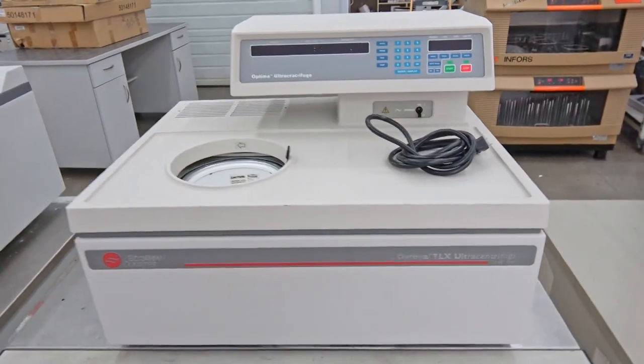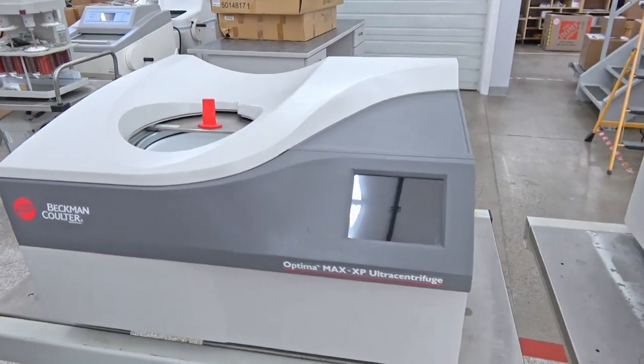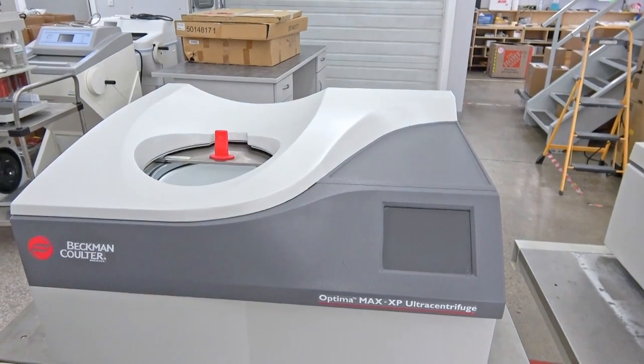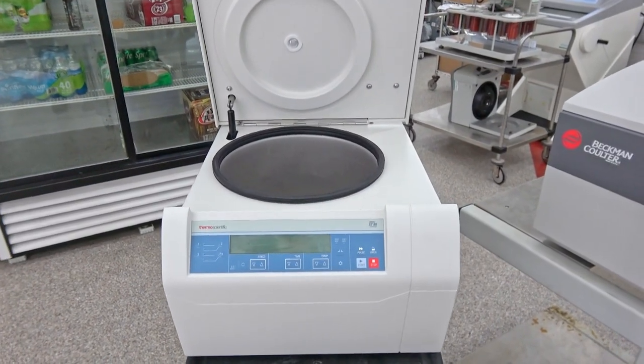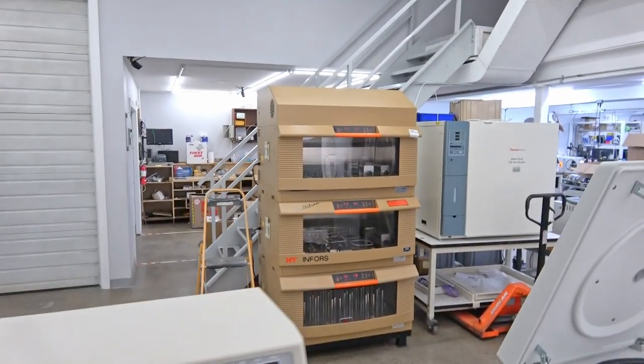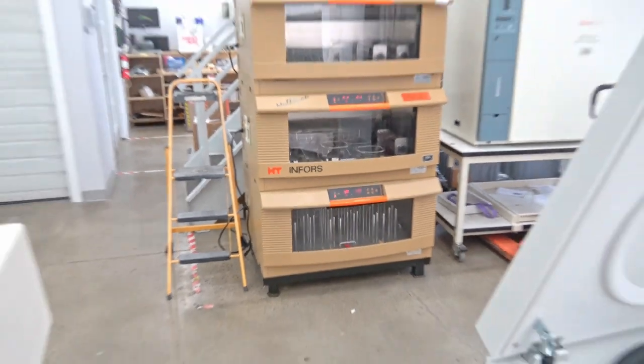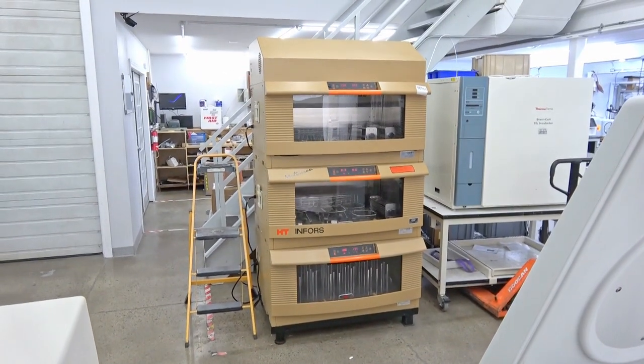Beckman-Coulter Ultra Centrifuge TLX, and another Ultra Centrifuge MAX-XP, and a Thermo Scientific ST8R. We also have over there a triple stack HT-Inforce refrigerated incubator shaker.